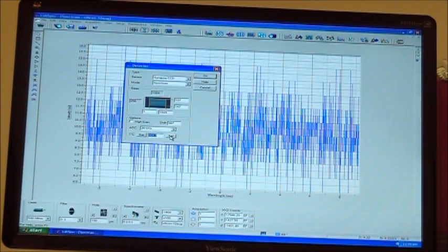If you come in and the system is all powered off and everything is turned off, as far as the other devices around, you just walk around, click power switches. You know, turn the computer on, the controller on, the laser on, CCD on. There's no real rhyme or order to them. Okay. Just click them all on.